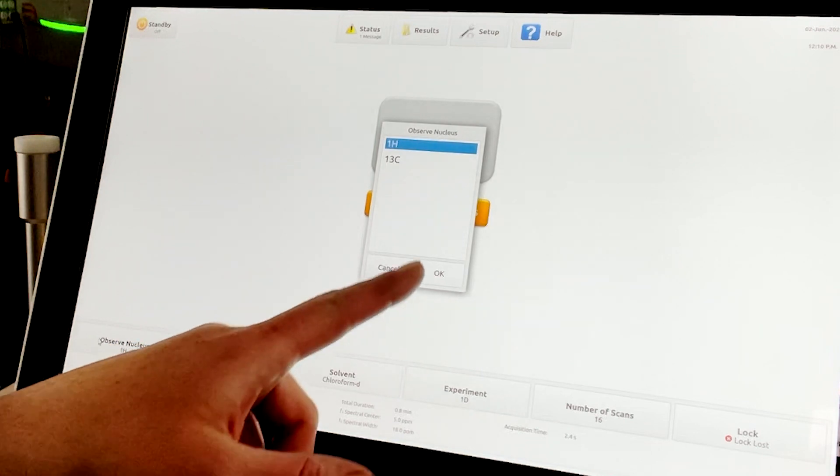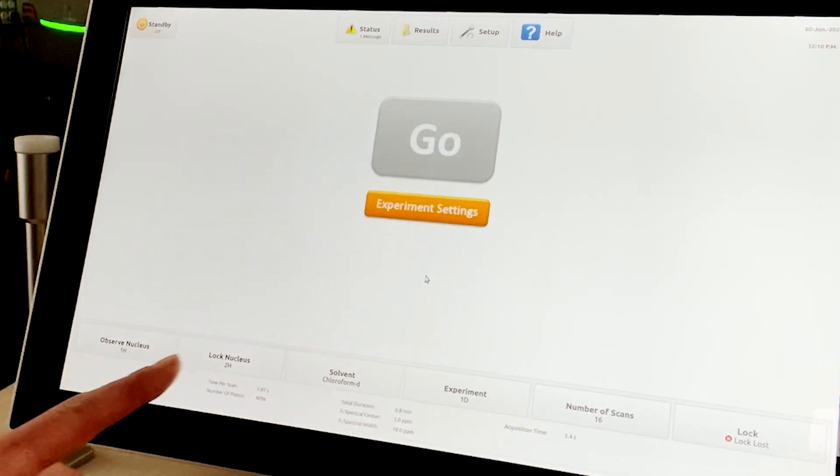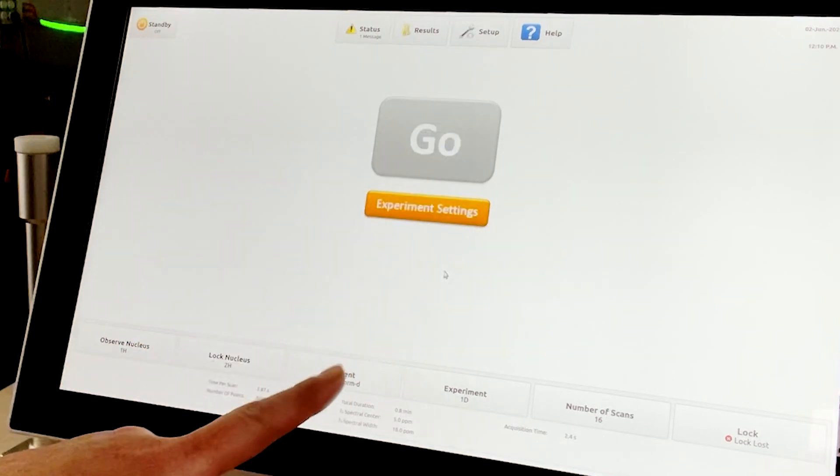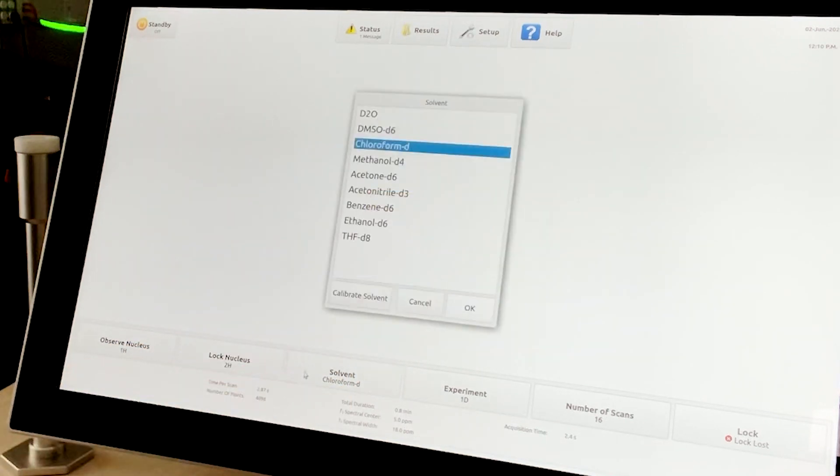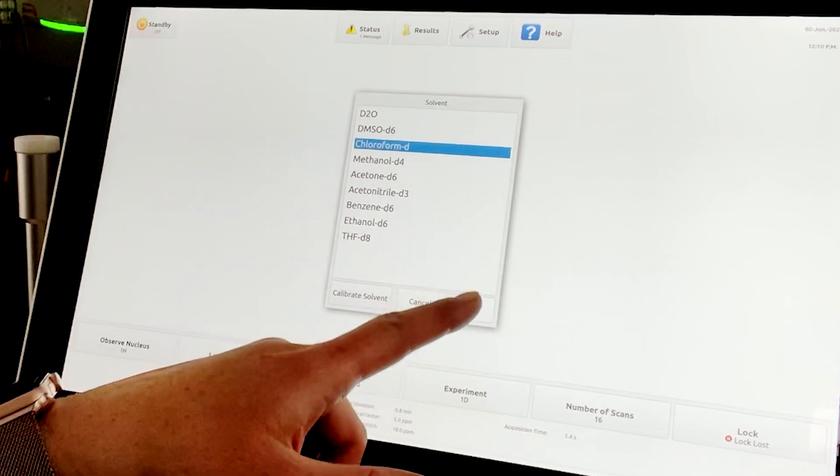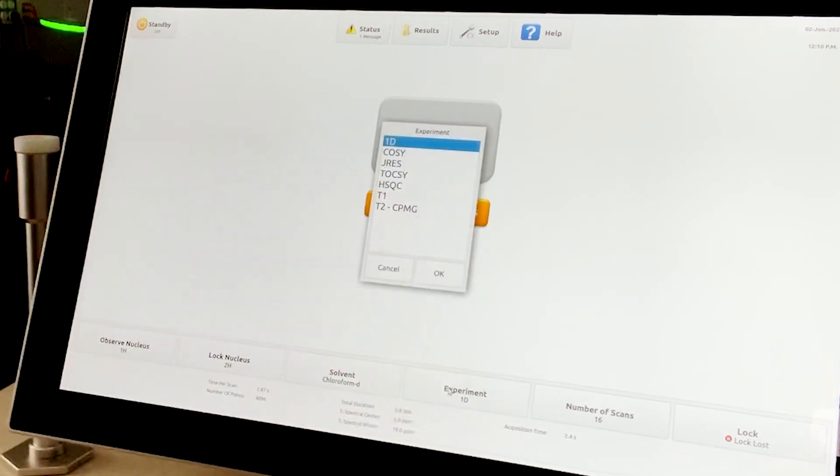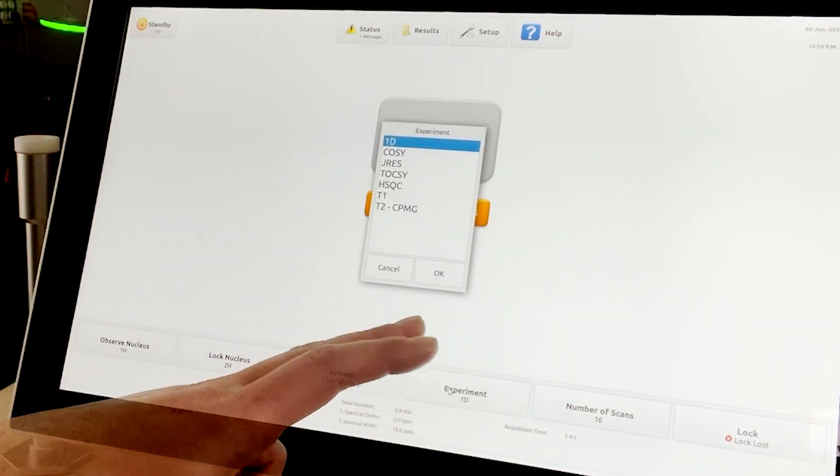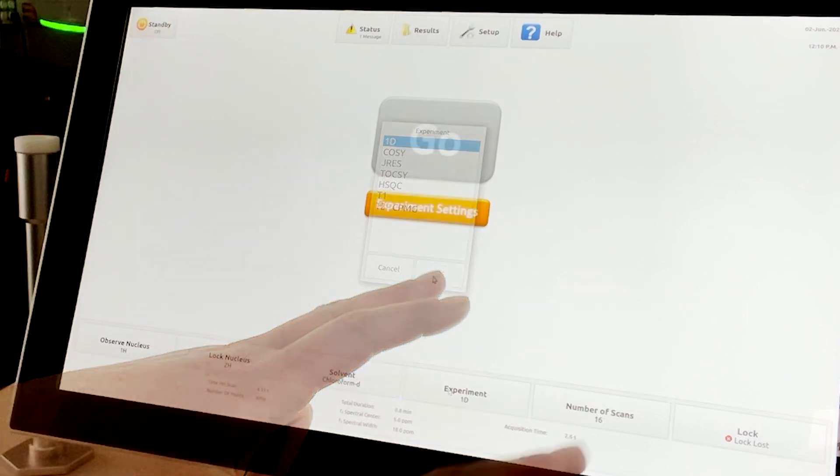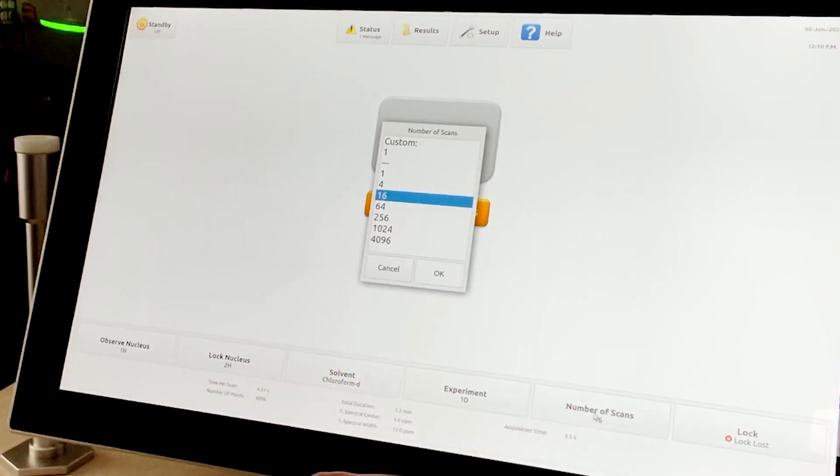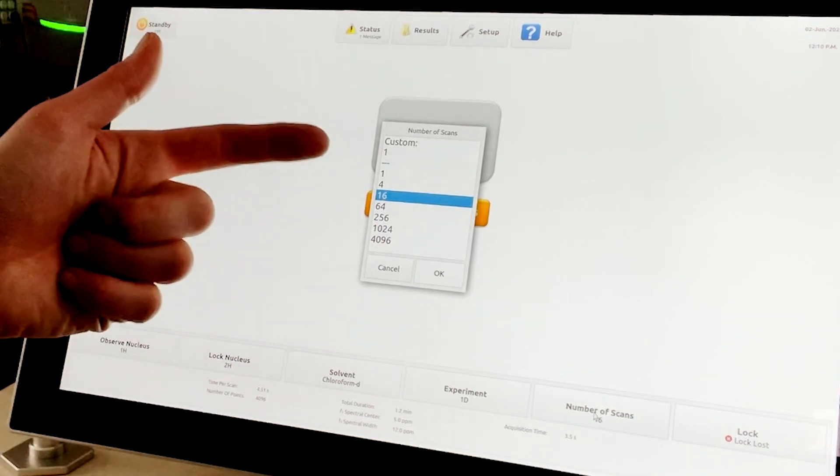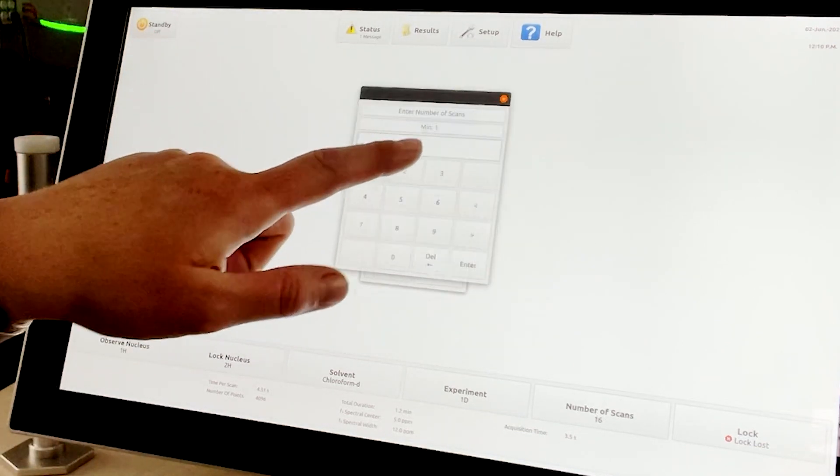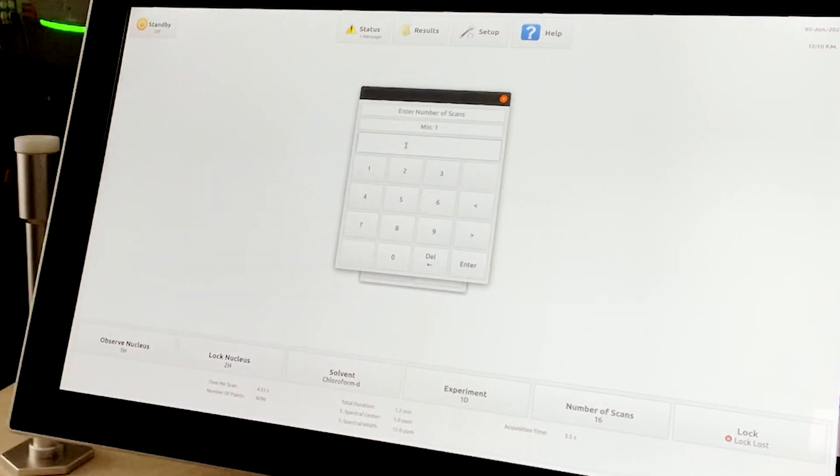We will lock on deuterium, as is quite standard. We have prepared this sample in deuterated chloroform, as is already selected. Each instrument has pre-configured standard experiments depending on the nuclei you have selected. We will run a 1D Proton. If desired, the user can change the number of scans and start the experiment without further modification.